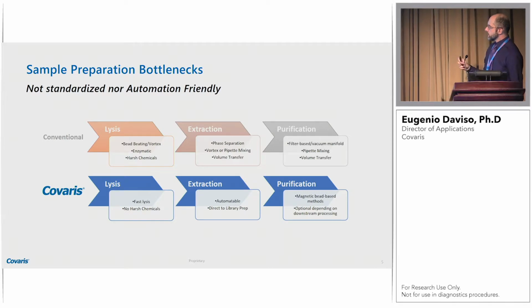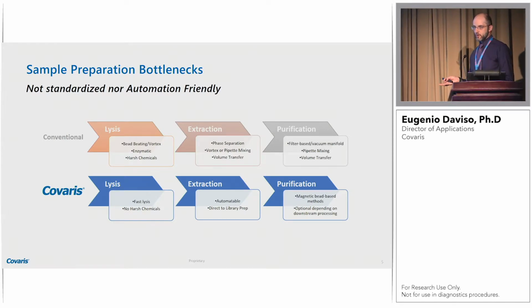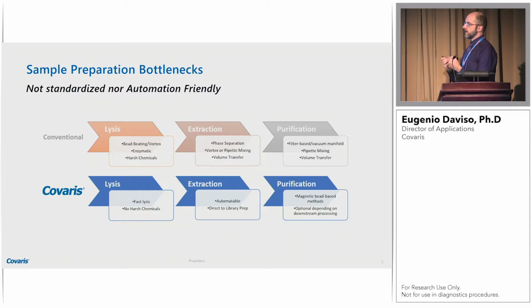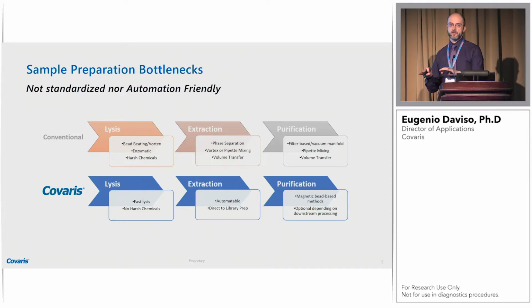So the sample preparation is always a bottleneck, and it's very interesting to hear among the audience several questions about how your DNA reading correlates to your sample preparation. And the answer is, yeah, it's very important that you have a sample preparation that is standardized and allows you to extract very high quality DNA or RNA or even proteins that you know are consistent and represent your sample very well.